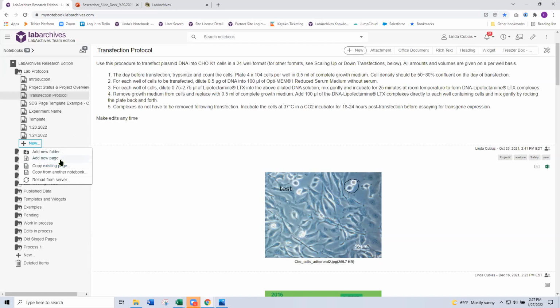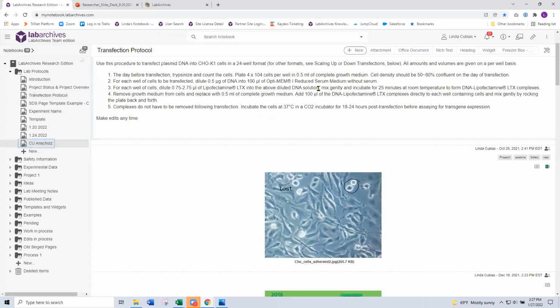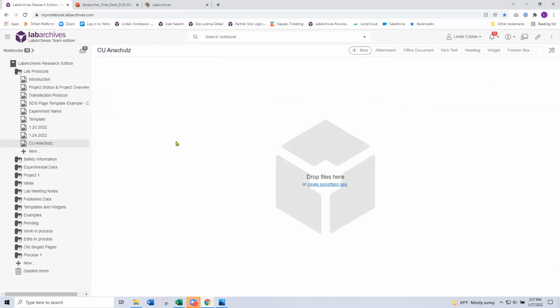So for our demo today, let's add a new page. Let's see, Anschutz, and we'll go ahead and click add. So now we have a new page. It's an empty page, and this is the page we'll use to upload all of our data today.